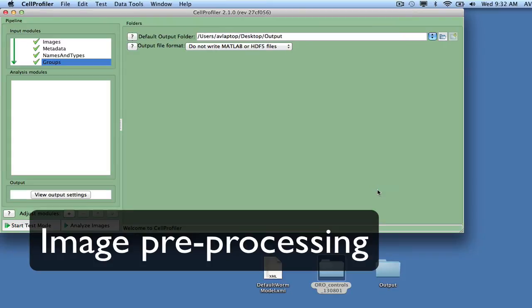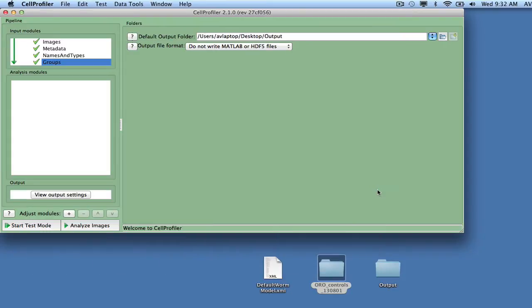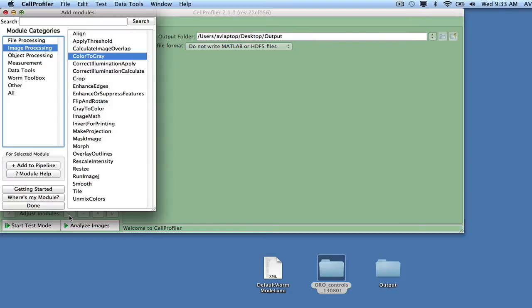Once the input modules are set, the analysis pipeline is built up by inserting modules into the analysis panel. Modules are added by clicking the plus sign next to Adjust Modules in the bottom left corner of the interface to bring up a list of selectable modules.